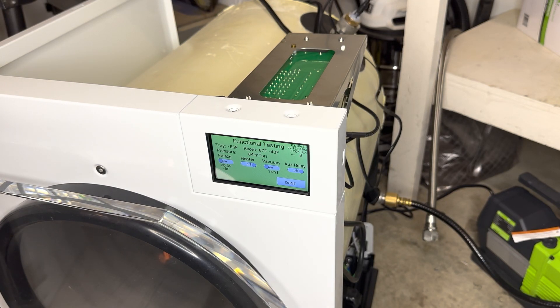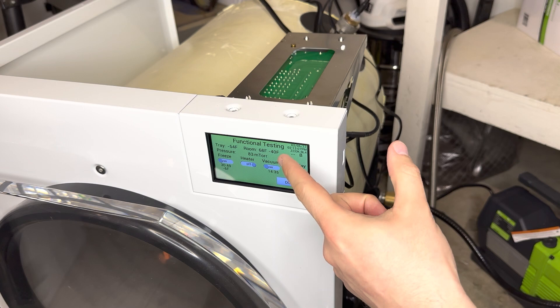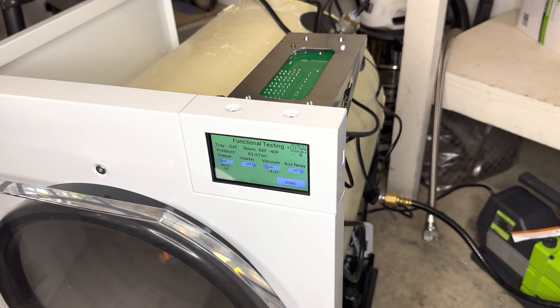Hey everyone, it's Donald. I want to go over today some of the leak spots and how to test for those. As you'll see, we are pretty steady at 83-84 mTorrs currently, so the machine itself I don't suspect we have any leaks. However, if you do suspect a leak, I do want to go over this stuff.